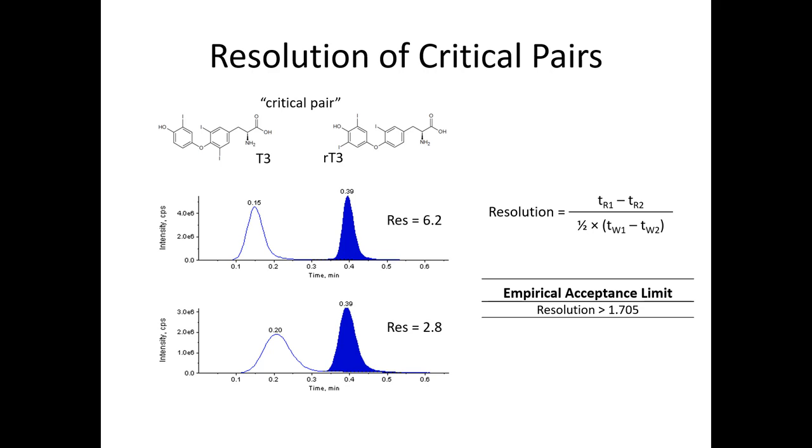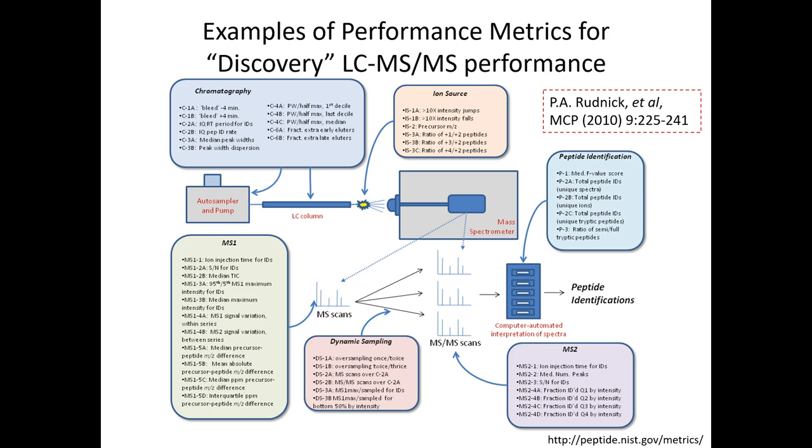So when we go from here, which might have been acquired in May, and here, this might have been acquired in June, you see that the peaks are broader and they're coming closer together. So if you see this with your system suitability sample, it will probably impact the data that you're trying to do for real science. Not that this isn't real science, but it's just less exciting.